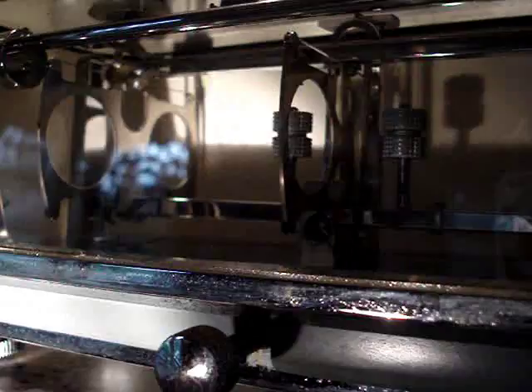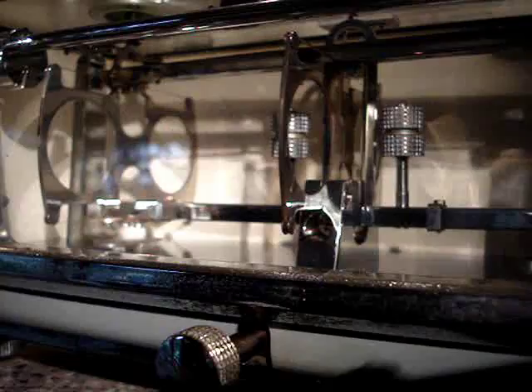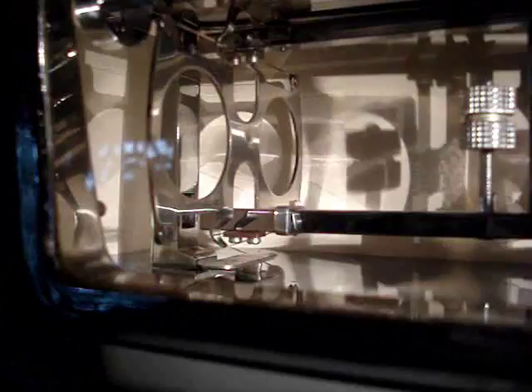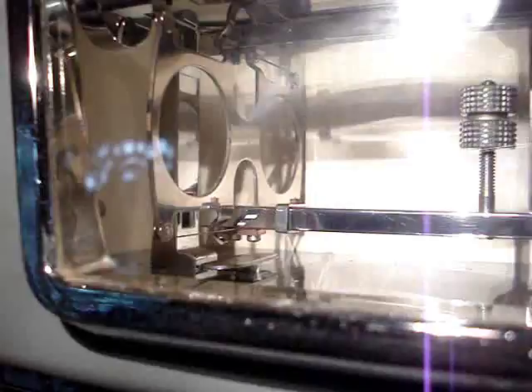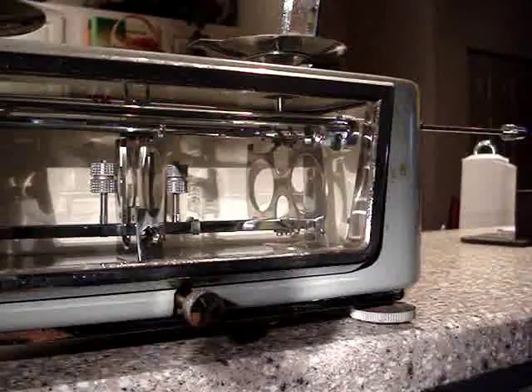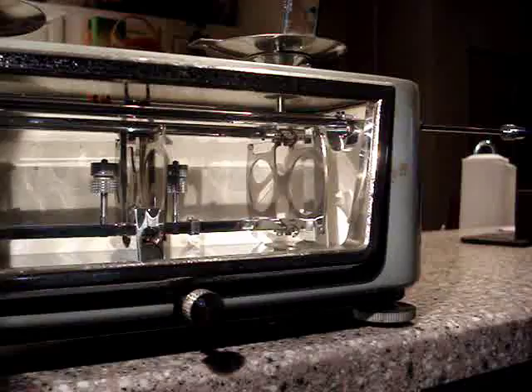Here's what it looks like on the inside of the scale. The scale's in motion now — it's pretty exciting. See those hair beams? They're in there. That's what it looks like when it's lit up in there, all chrome-plated. Here's your middle area view of the mechanism — it's very nice. And here's your right area view. It's a pretty good little scale. You'll like it.